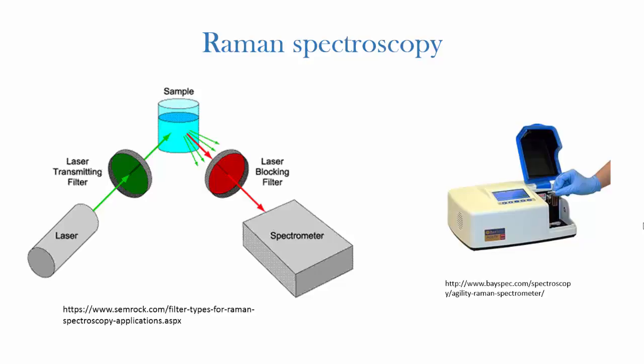Conversely, relatively neutral bonds such as carbon to carbon, carbon to hydrogen, or carbon to carbon double bonds suffer large changes in polarizability during a vibration, though this is less easy to visualize. But the dipole moment is not similarly affected, and vibrations that predominantly involve this type of bond are strong Raman scatterers but weak in the IR.